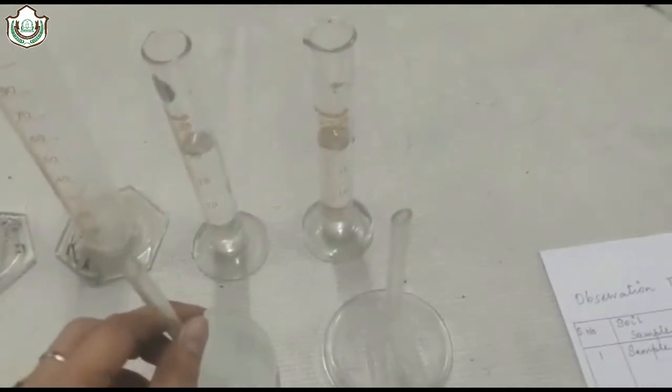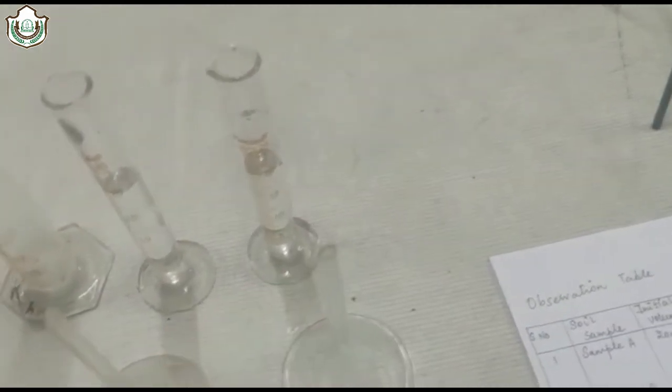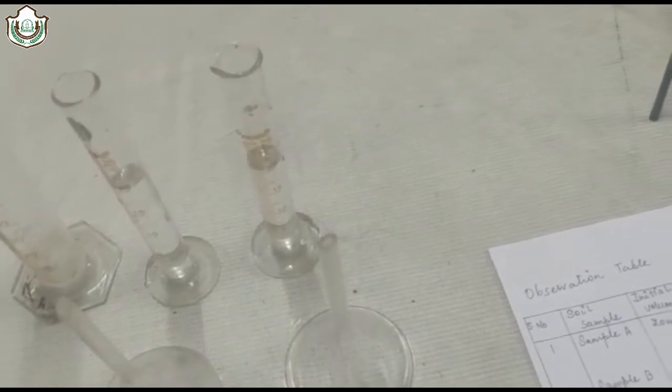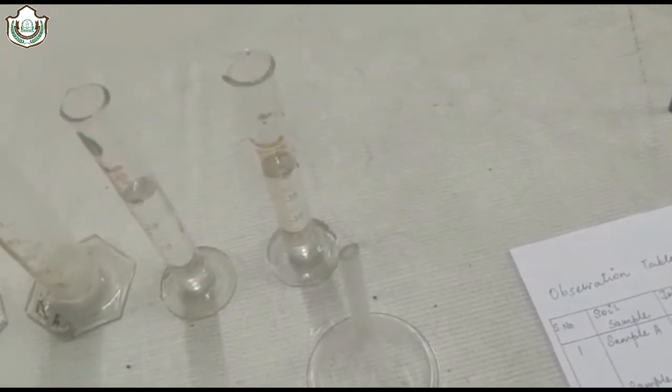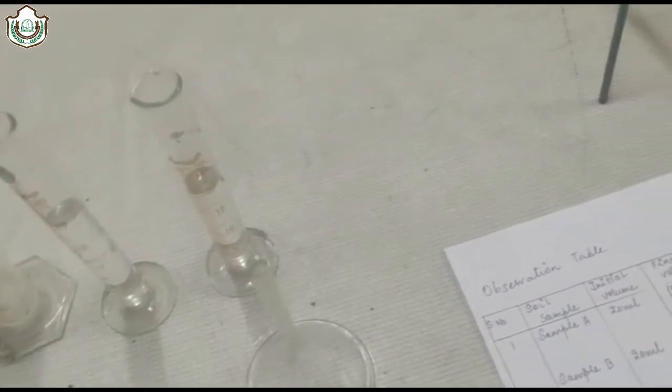Now take two measuring cylinders and two measuring cylinders filled with water, funnels, and filter paper. Now first of all, we have to take this soil.